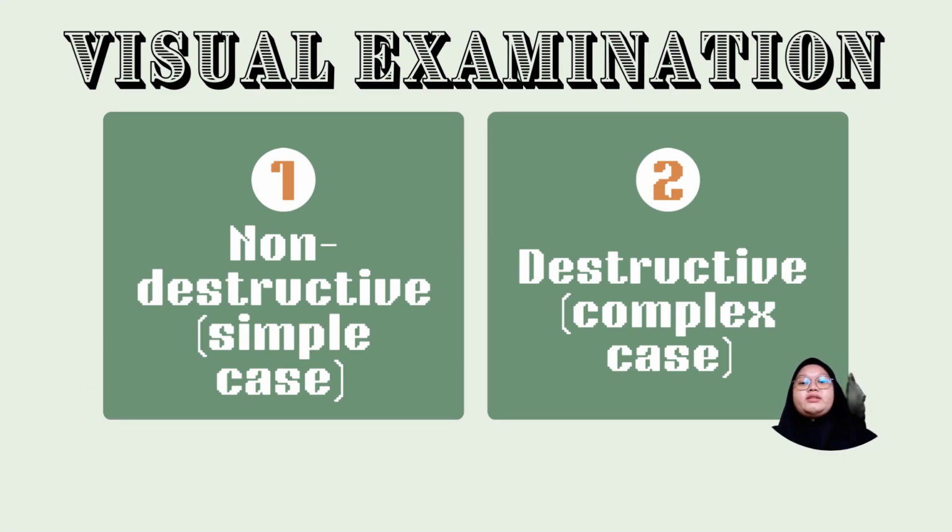For more complex cases, and given the similarity between many commercial inks, it is necessary to employ one or more analytical methods that could be grouped into three classes: separation techniques, mass spectrometry, and other spectroscopy techniques.